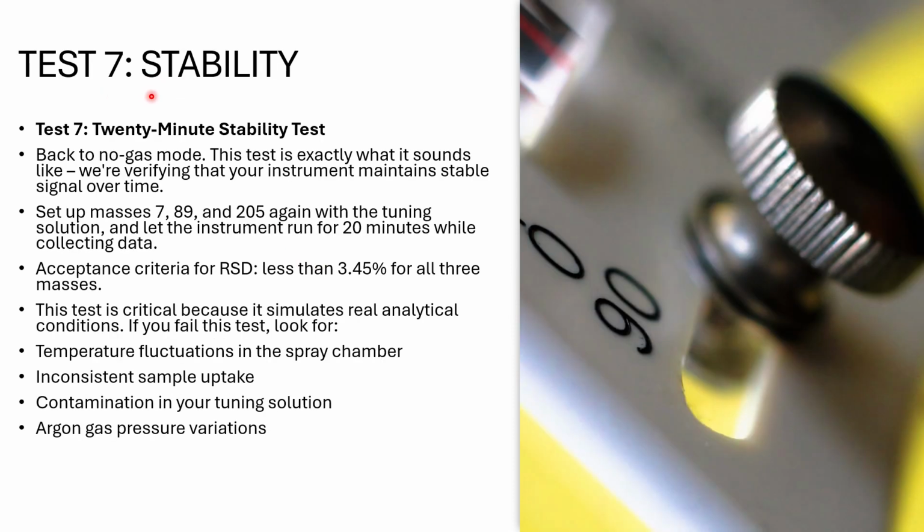Now let's come to test 7, that is stability test. In this, you have to come back to no gas mode. And this test is exactly what it sounds like. We are verifying that your instrument maintains stable signal over time.